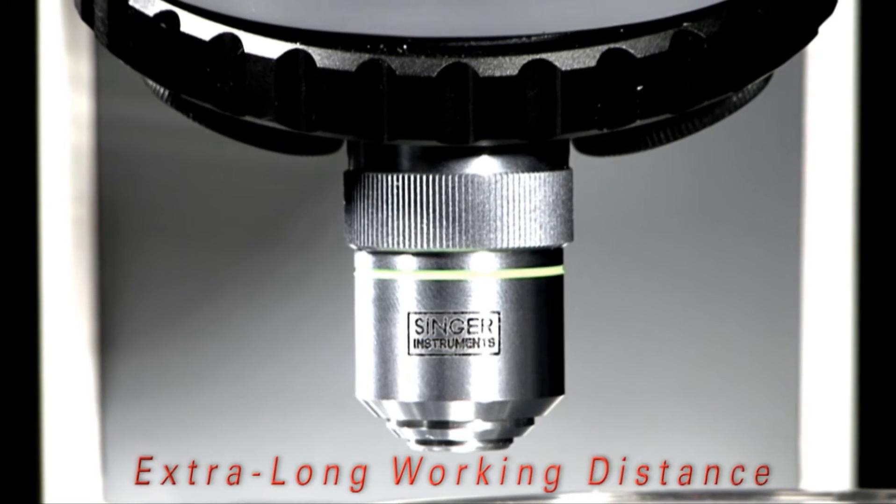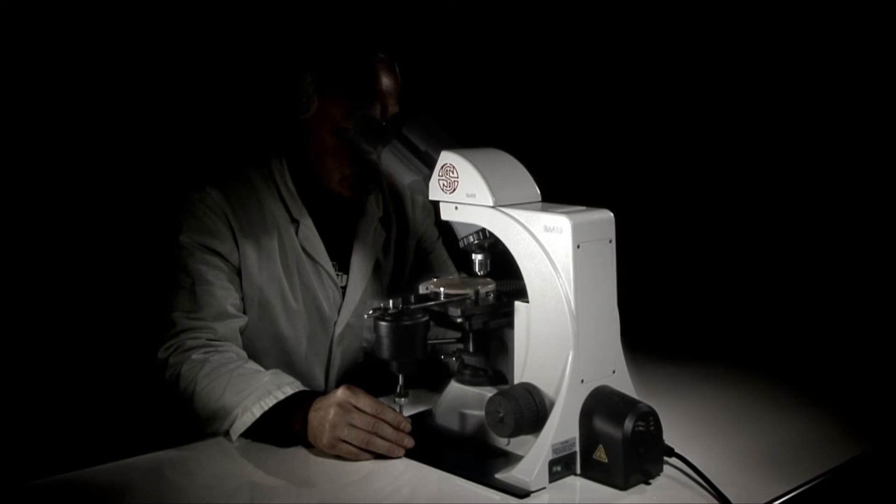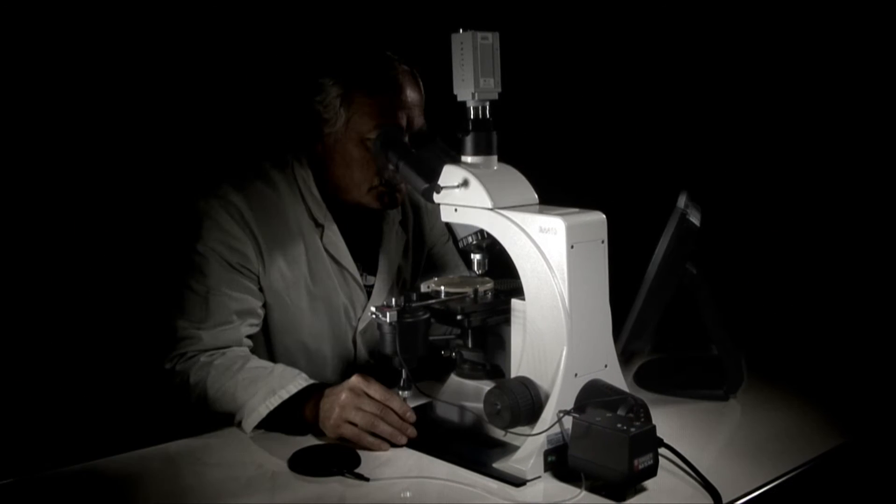The optimum choice of optics for yeast tetrad dissection. Fully adjustable binocular head minimizes strain and fatigue. Modular microscope platform for an array of expansion options.